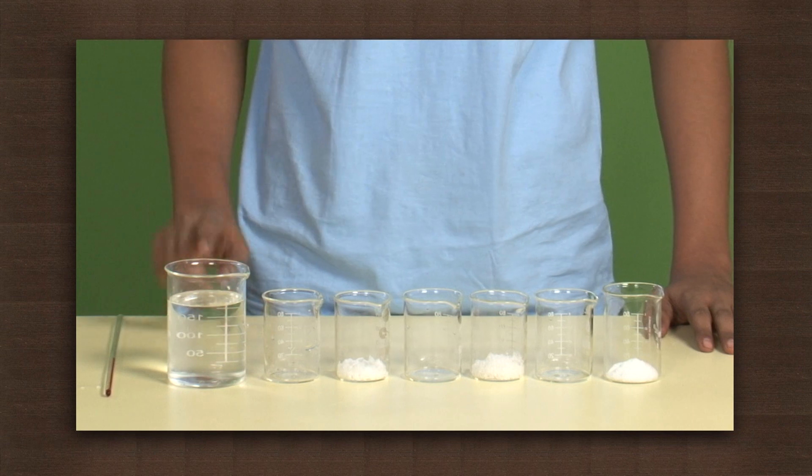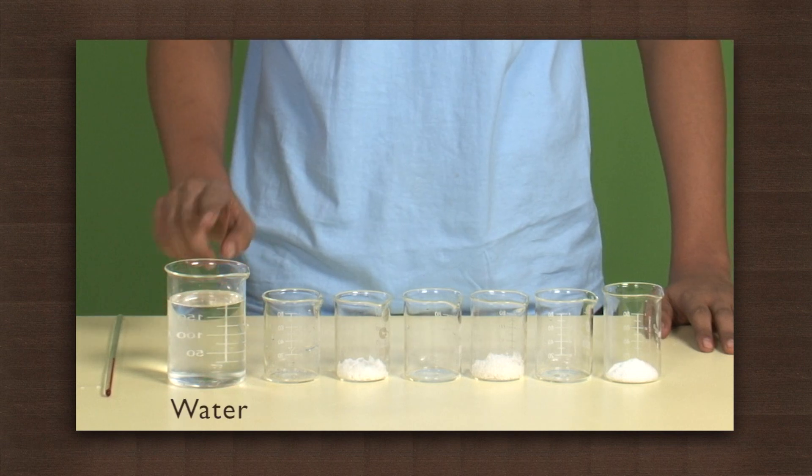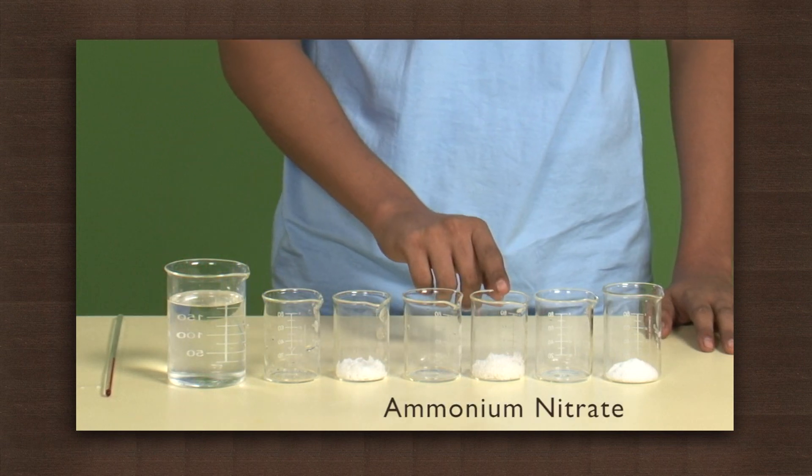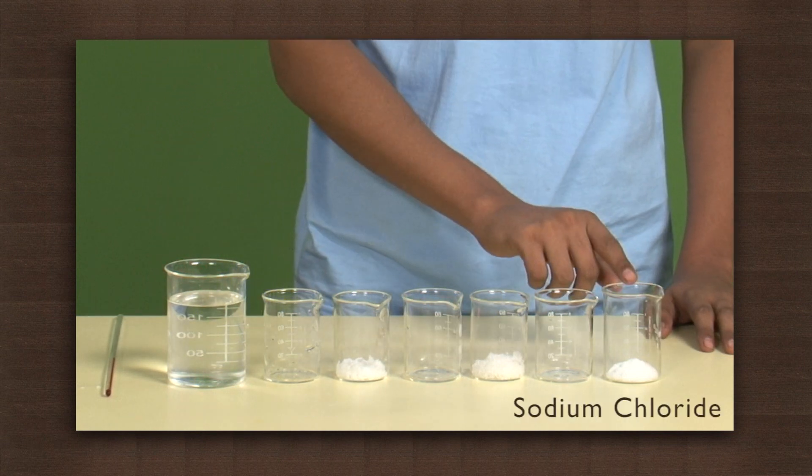We need some water, sodium hydroxide, ammonium nitrate, and sodium chloride.